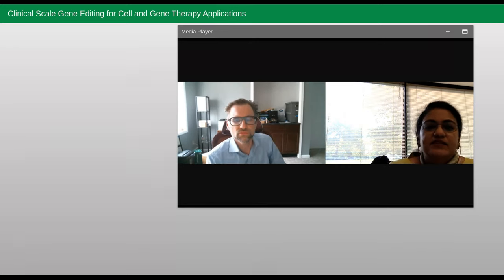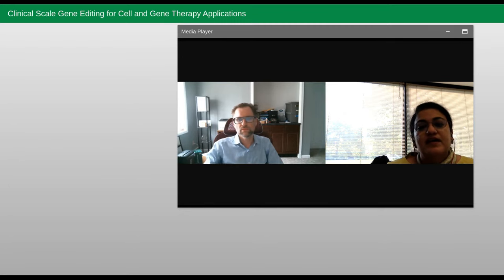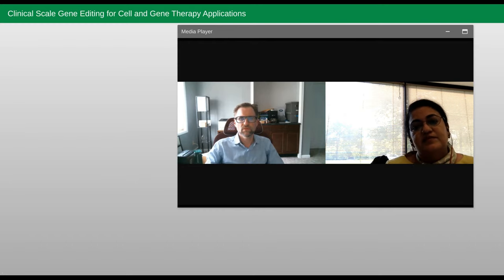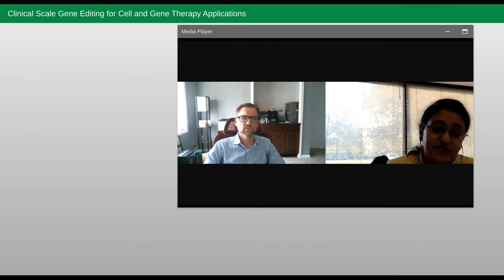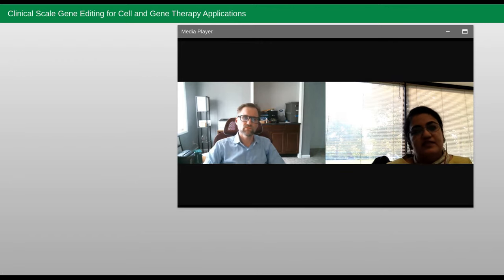I think most electroporation technologies are looking to be in the clinic in the 3 to 5 years, like we are. Certainly most of our competitors are. As the field moves towards allogeneic therapies, you'll have a lot more gene editing applications becoming important in the clinic, and to deliver the gene editing tools, electroporation becomes a big factor. So I think most electroporation technologies will have to be cGMP certified, they'll have to be closed, and also have an integrated workflow that integrates the upstream and downstream processes in a smooth workflow. So that's where I see this technology heading.